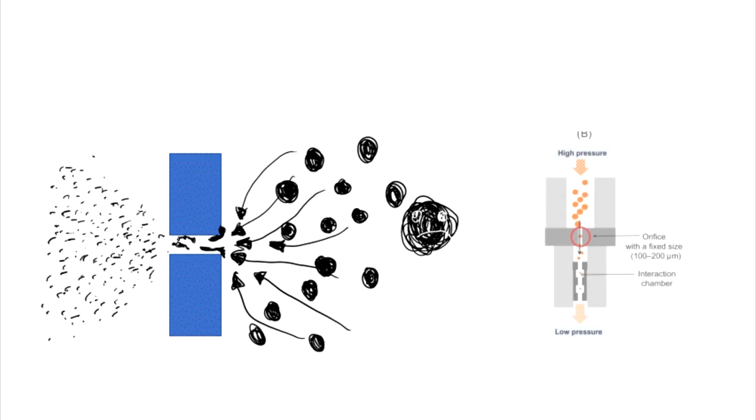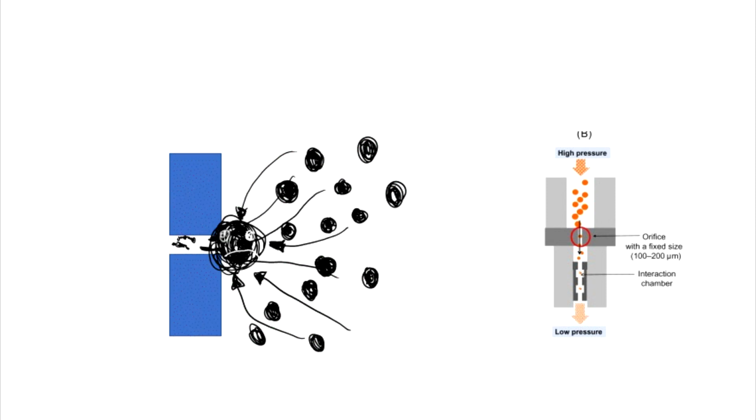To decrease the gap distance, high-pressure homogenizers typically use a fixed opening in the form of an orifice or microchannel. They need to make this as small as they can, but without subjecting the whole system to clogging. Very small, fixed openings will easily clog if made too small.